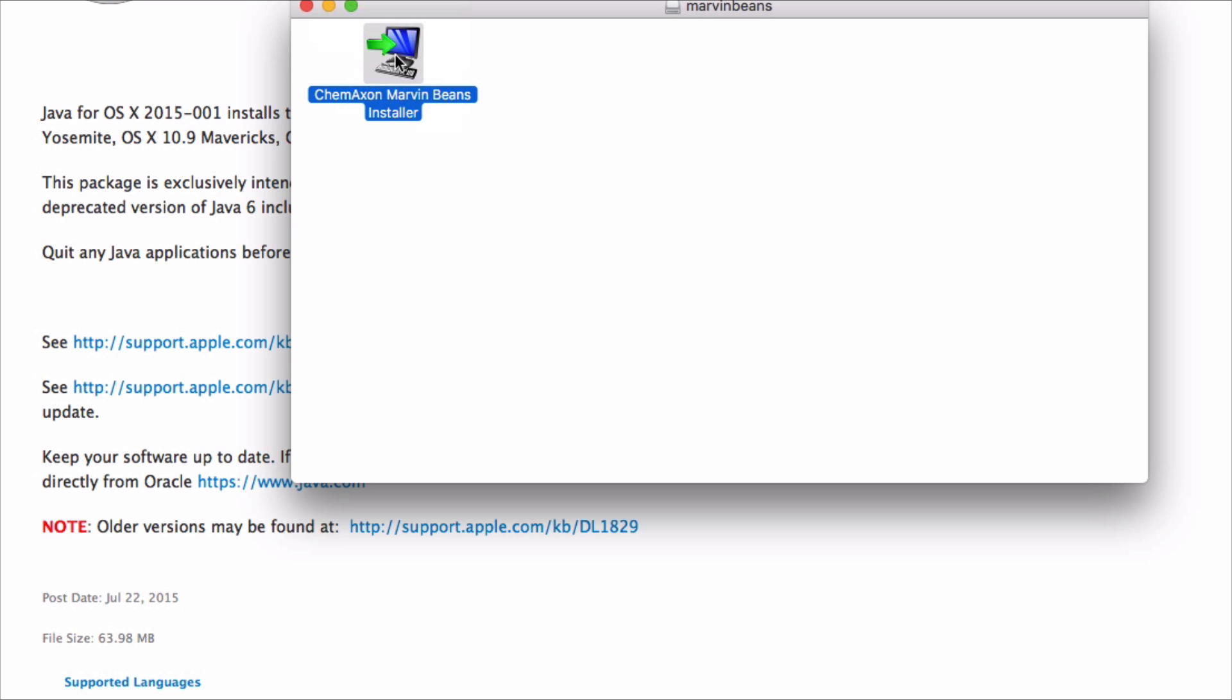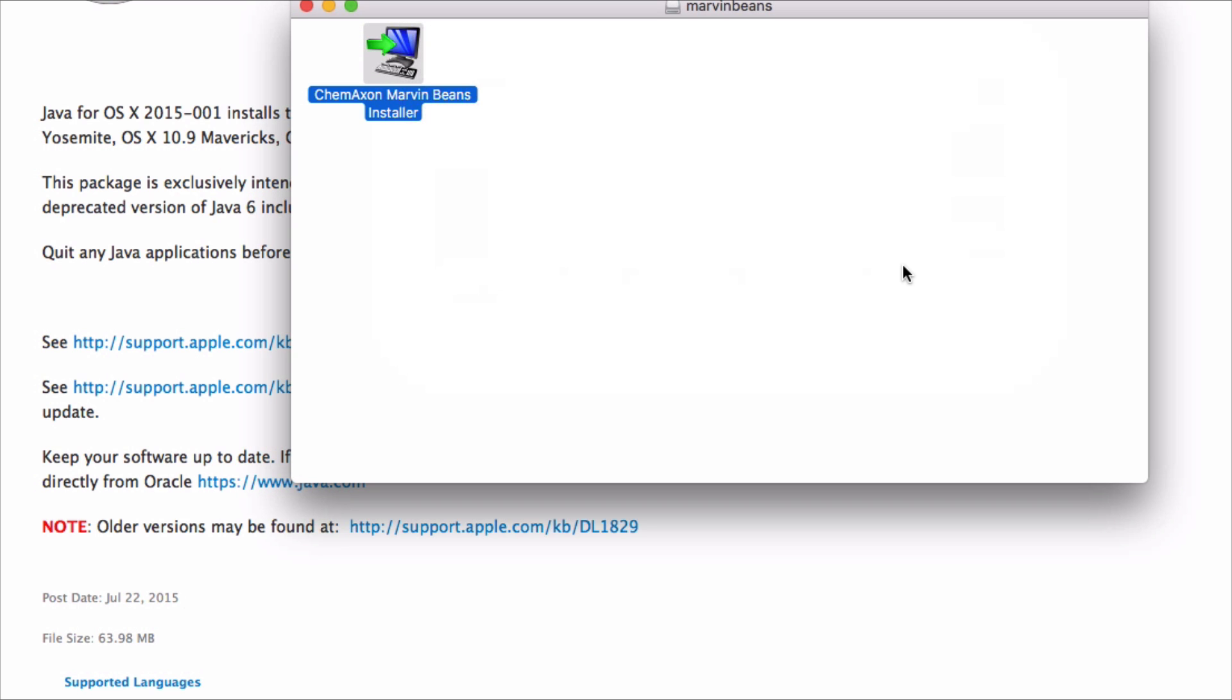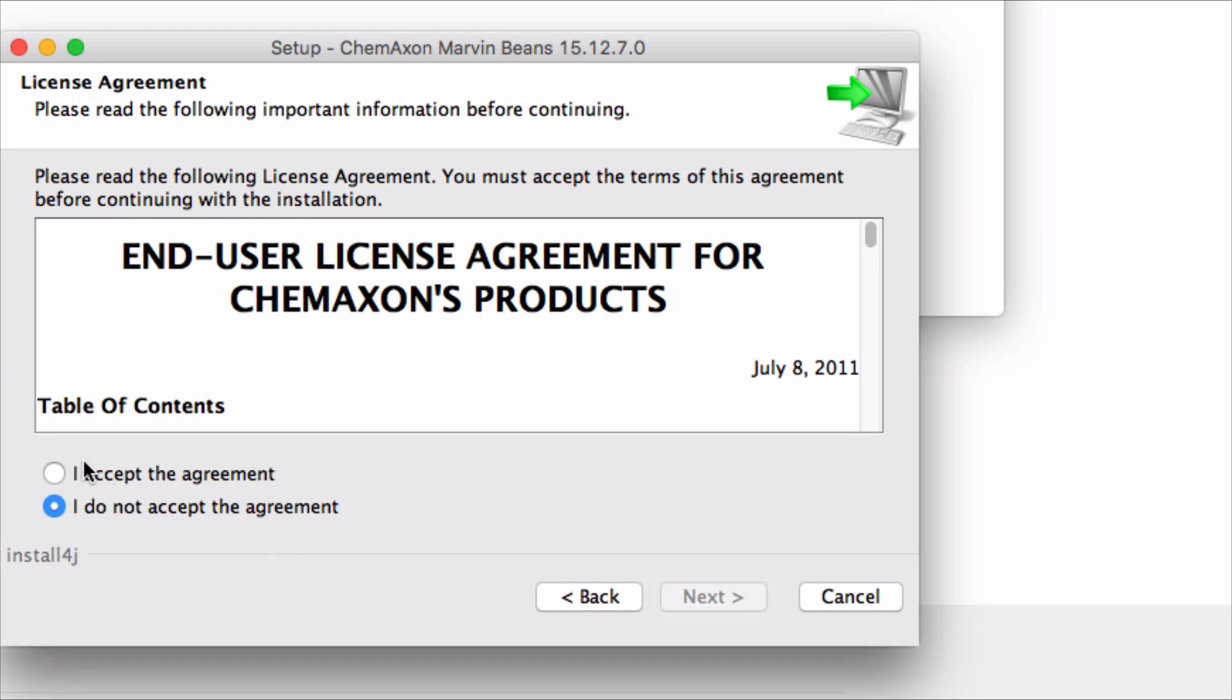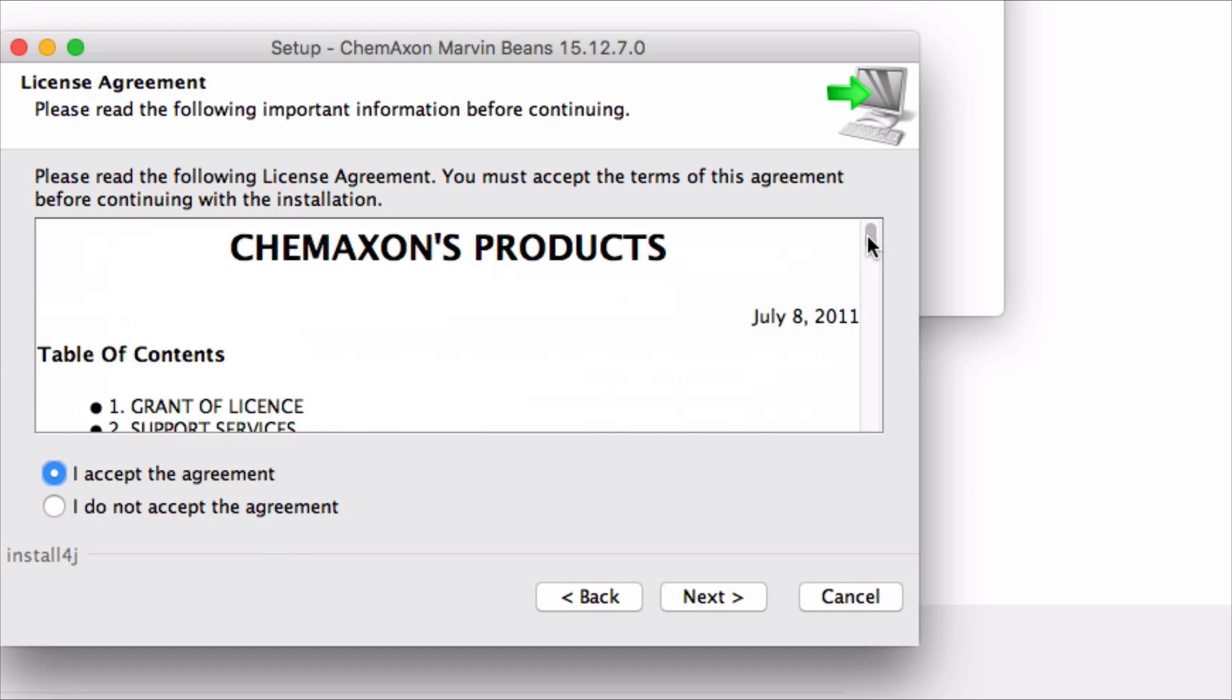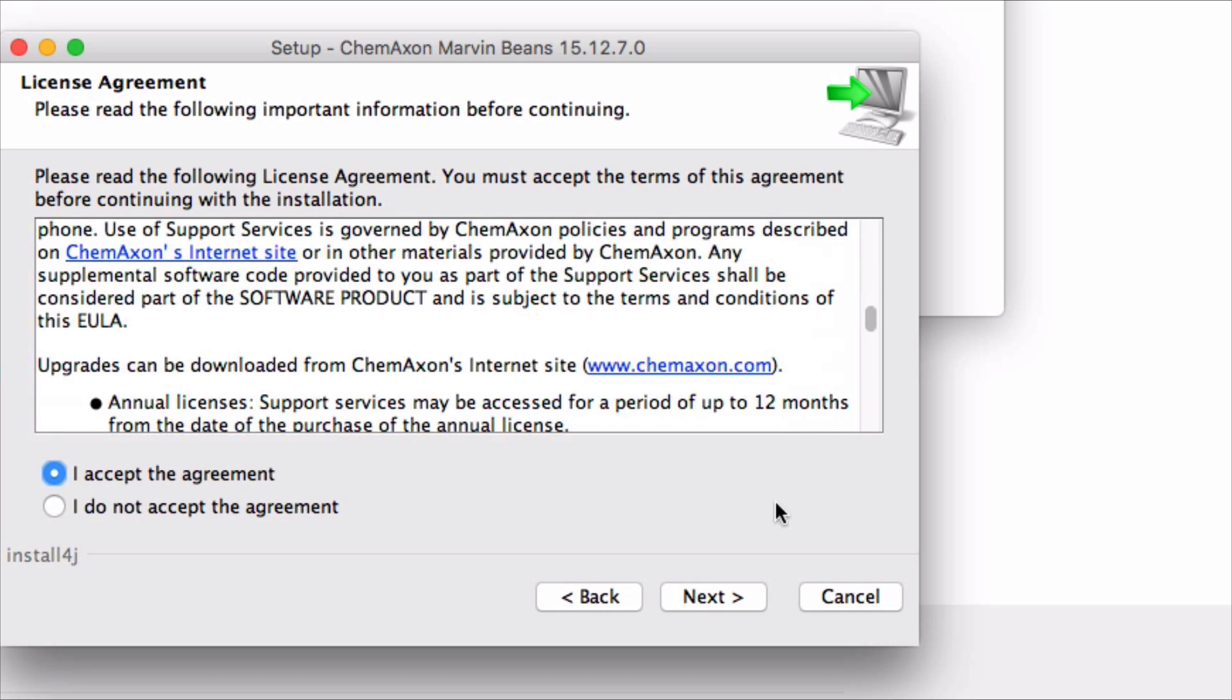Good, the installer launches now that I have Java SE 6. Yes, I want to open it. Click next. Read and accept the agreement. Once you've reviewed the agreement, click next.